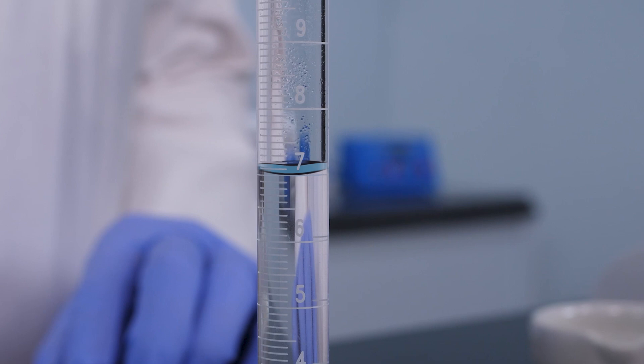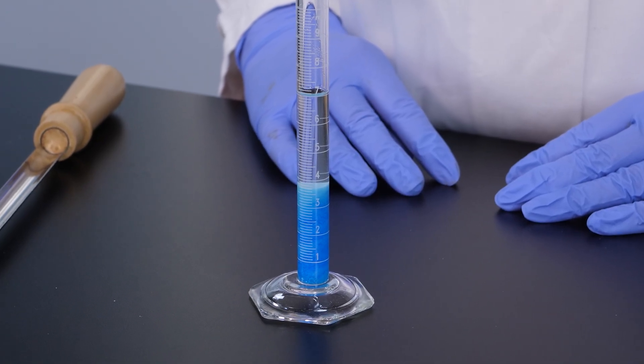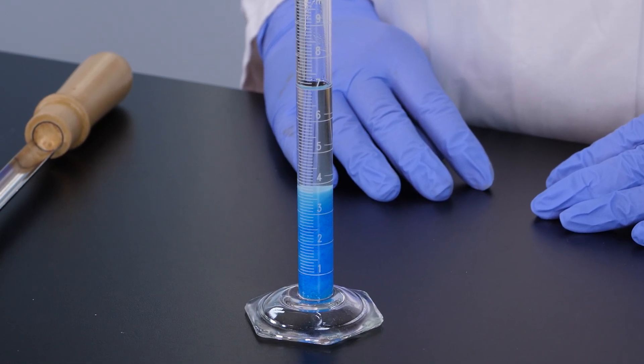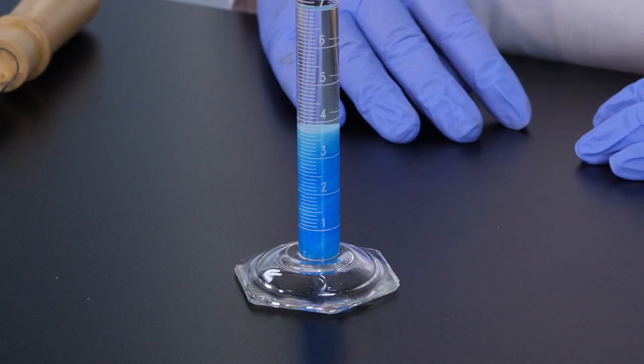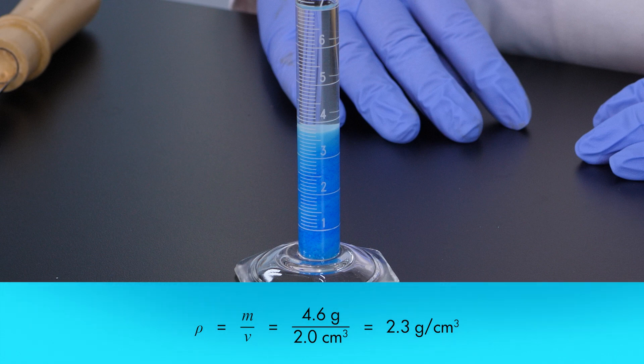We add 4.6 grams of the substance. Notice that the level of the acetone in the graduated cylinder rose to 7.0 milliliters. When we place the substance in the acetone, it takes up space in the liquid, causing the fluid level to rise. The difference between the two volumes is 2.0 milliliters. So we know that the volume displaced by the substance is 2.0 milliliters, or 2.0 cubic centimeters. After finding the volume of the substance by fluid displacement, we calculate the density by dividing the mass by the volume. We discover that the density is 2.3 grams per cubic centimeter.